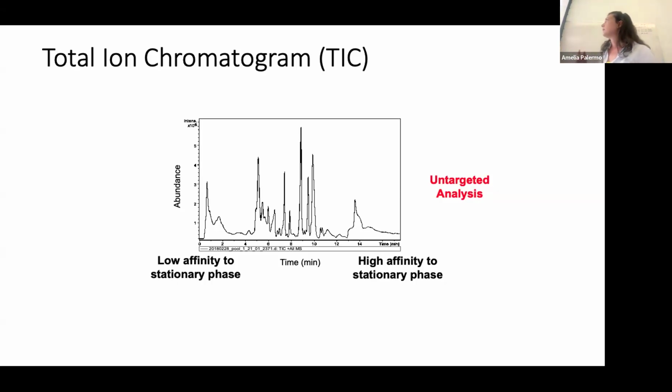And in the quality controls across your columns, that's one of the aspects that is really important to look into. If your gradient, your setup is not optimized for the applications, the length of the chromatography, there are a lot of parameters around that that allow you to make sure that your sample was in here and was out by this time, and you don't have further retention that is going to be built up in the next round, right?